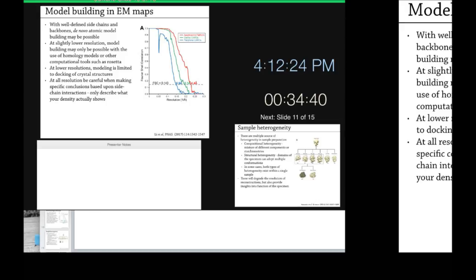I was just wondering actually what kind of resolution you need to see a ligand, a small molecule. It depends. Sometimes I've looked at maps that are 3.5 angstroms and ligands are great. Other times at 3.5 angstroms you see no good density for the ligand. You know that there's something there, but there's no way that you could orient it or register it relative to the protein. It depends on what the occupancy is, how flexible the ligand is, and how flexible everything is around it.